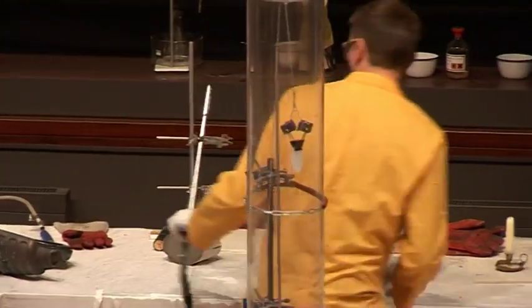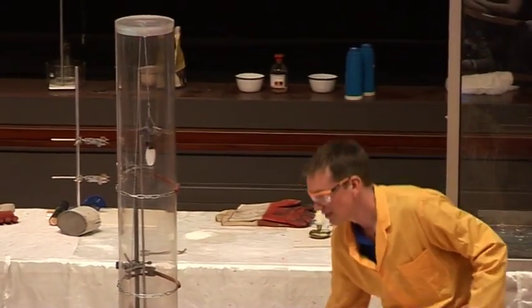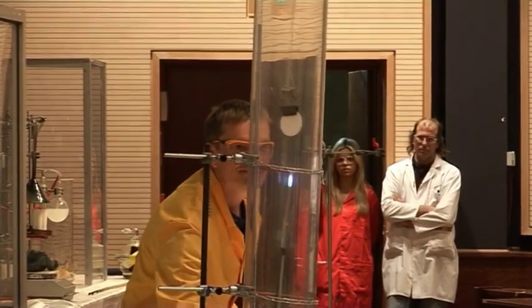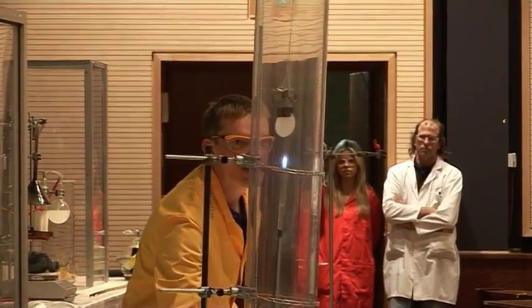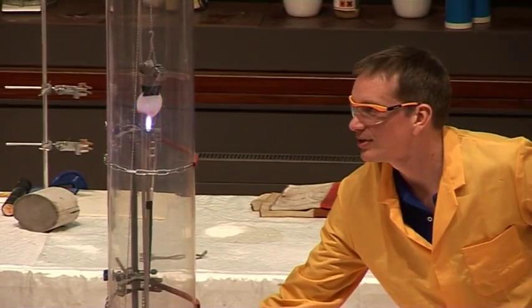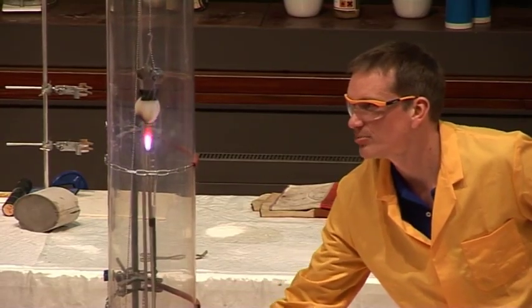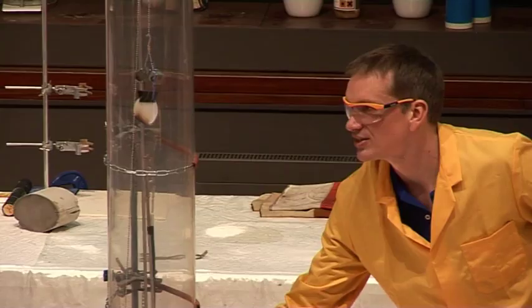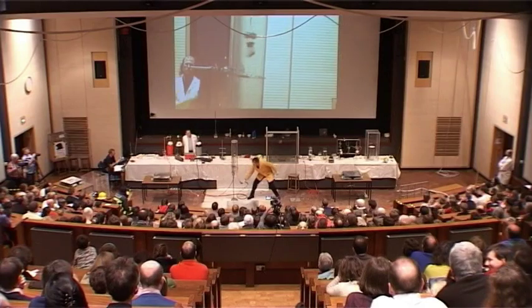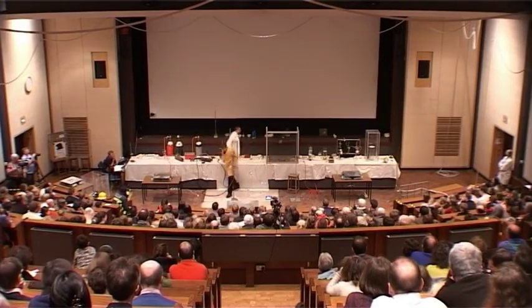Right, now then, what will happen? So, ready? Okay, click it on. Okay, so the oxygen is now burning, and the petrol and the paper do not burn. Only when the oxygen flame is directly on this does the paper begin to smoulder, but it certainly isn't catching fire. Okay, off. Right, thank you. Phew, that's good.